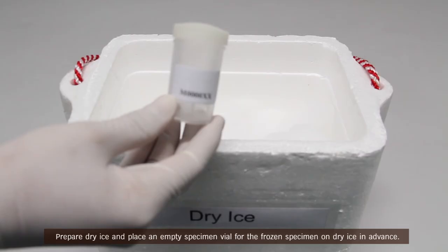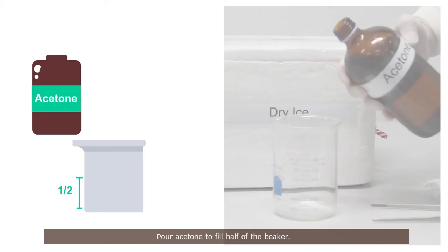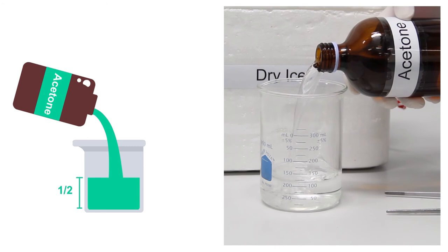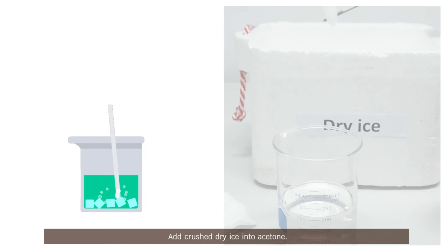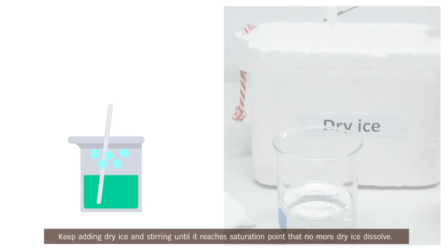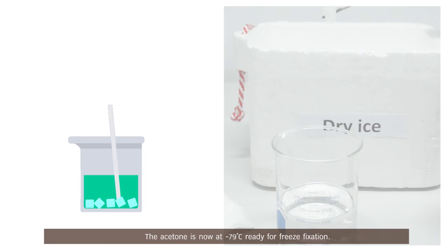Prepare dry ice and place an empty specimen vial for the frozen specimen on dry ice in advance. Pour acetone to fill half of the beaker. Add crushed dry ice into acetone. Keep adding dry ice and stirring until it reaches saturation point that no more dry ice dissolves. The acetone is now at minus 79 degrees Celsius, ready for freeze fixation.